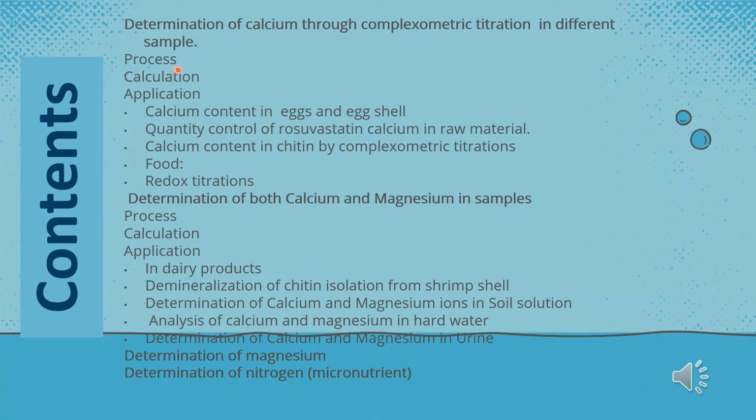So here is what we're going to cover, and our main topics are determination of calcium in different samples, then determination of both calcium and magnesium, and then determination of magnesium only, and finally determination of nitrogen.